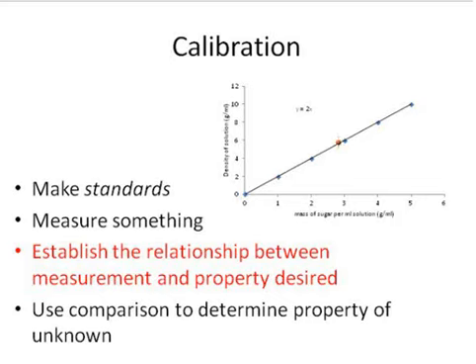So we're plotting the individual points, and when we get through plotting the individual points, which you will do as a scatter plot within Excel, be careful you select scatter plot because that's not the default in Excel, and we will just plot points, so individual markers. You will establish the linear relationship between the dependent variable and the independent variable, between the measurement and the known values. And this linear relationship is something we typically like to see in chemistry because it makes the math really simple.